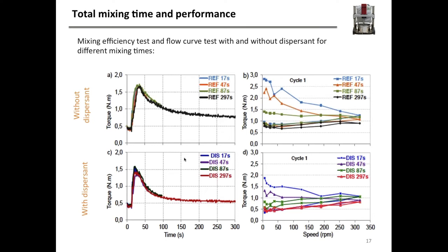And as you know, the interaction between materials is really what guides the performance of those mixtures. Very often the materials standalone look very good, but when you mix them together, there are some interactions, and you cannot really understand those interactions unless you make a continuous measurement of what happens during mixing. And on the right-hand side, we did those flow curve tests, so those shearing cycles that I mentioned earlier.